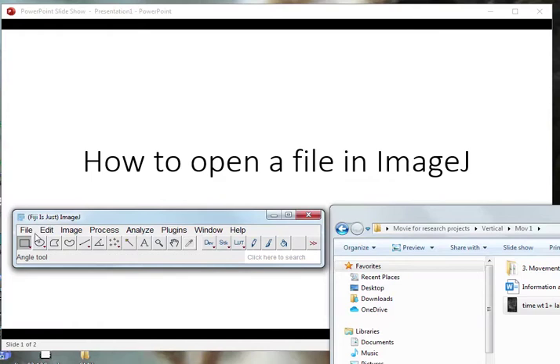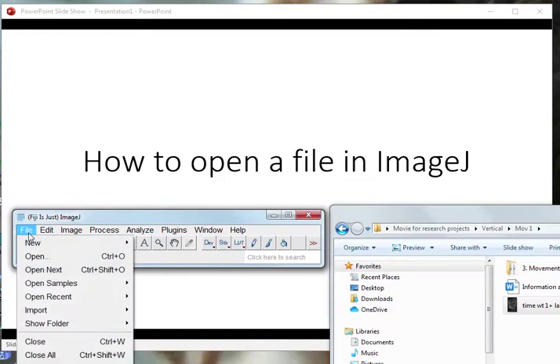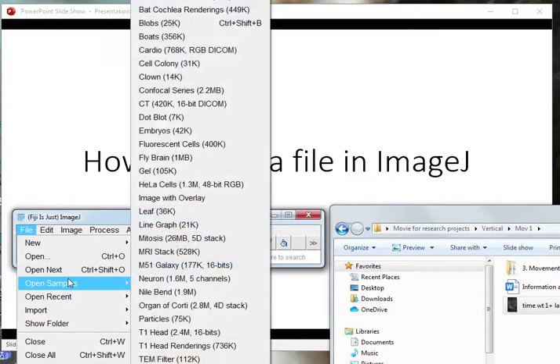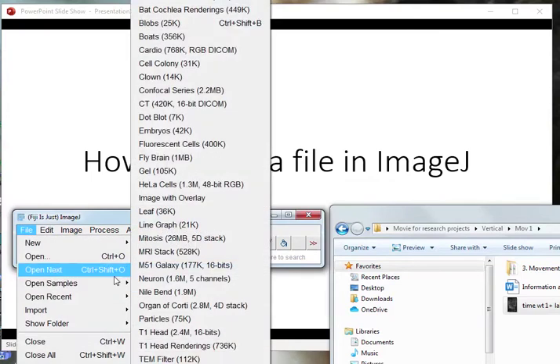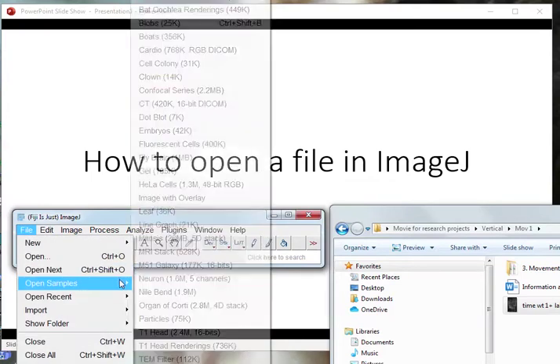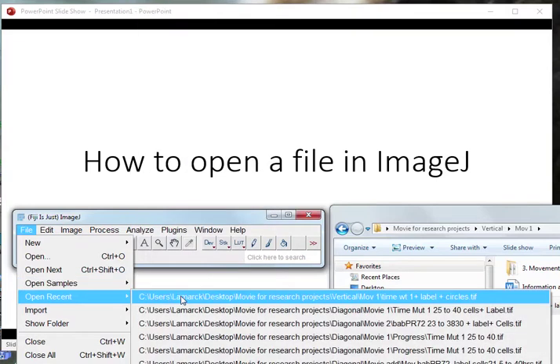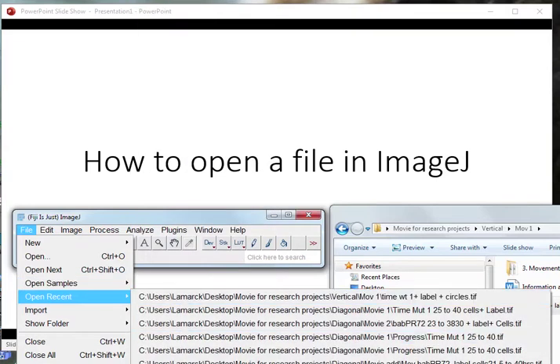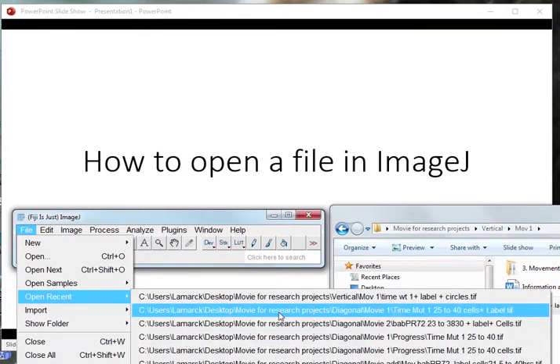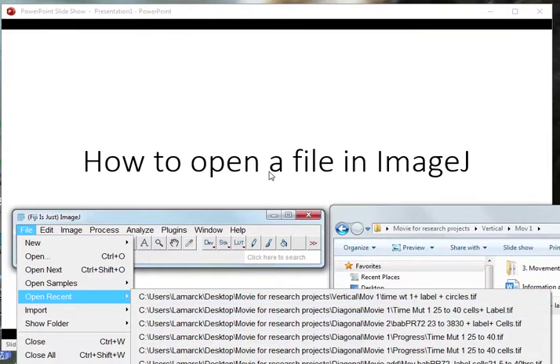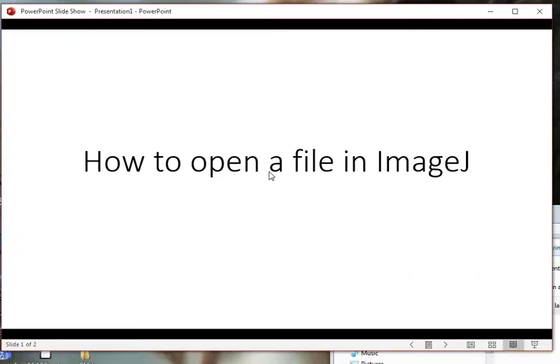The other option is if you opened a time movie, timelapse movie a few days ago, you could go just to Open Recent and you can open the recent files that you have.